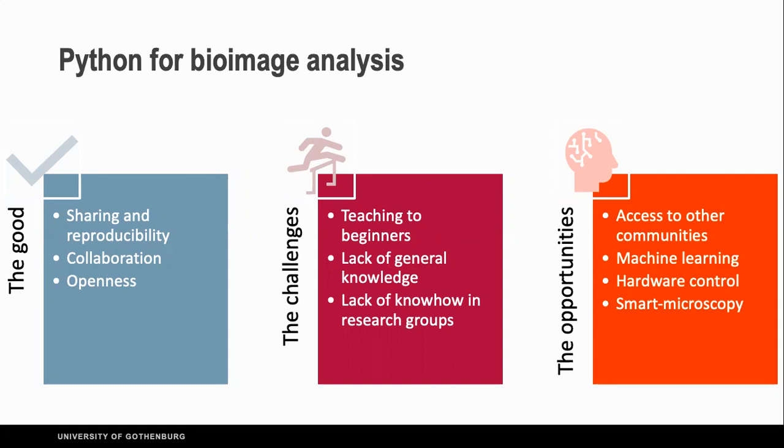The other thing is that, of course, there is a lack of general knowledge in some fields about programming languages, especially something like Python. So I think there is a lot we can do from the education side. If we just teach a little bit of programming to people, this will become a lot easier. We should not have to teach bioimage analysis and programming together, it's not the same. If people know a little bit of programming, then we can really concentrate on the bioimage analysis.